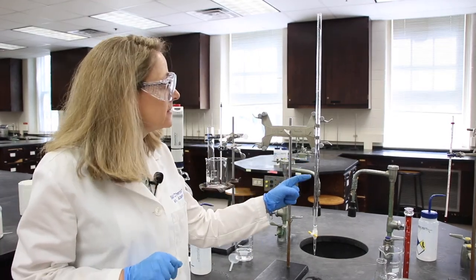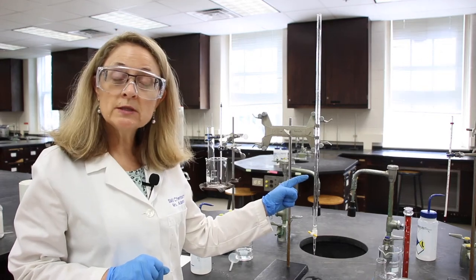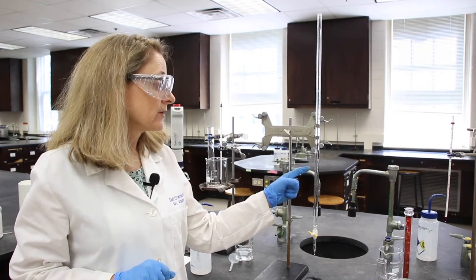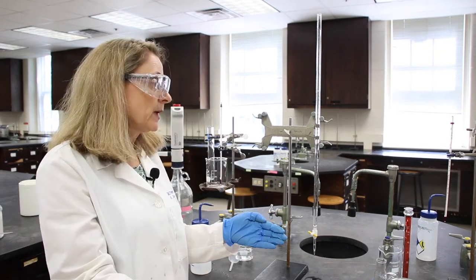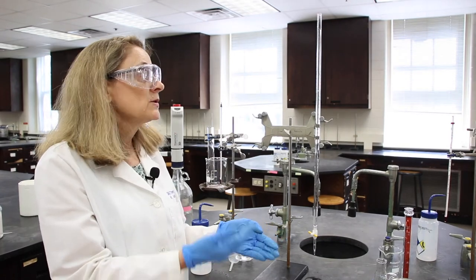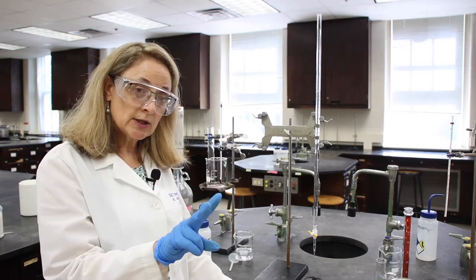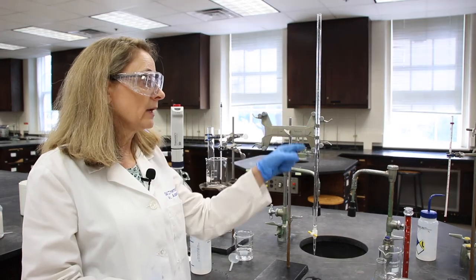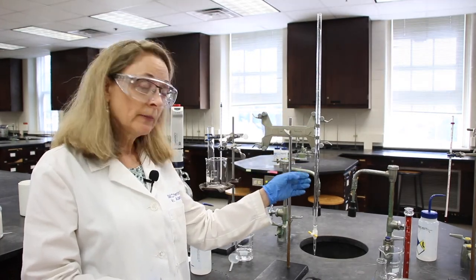The smallest division here is 0.1 milliliters. So that means we need to estimate to the hundredth. So there should be two digits after every reading on this burette.